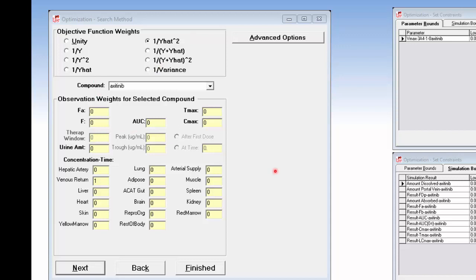In the lower portion of the dialog box are the observation weights for the compound. The units on the PK parameters are different — for example, fraction absorbed is simply a fraction going from 0 to 1, whereas the concentration profile might be in micrograms per milliliter, which is a larger value. So if you were optimizing both, you might want to weight the fraction absorbed higher than the concentration time profile.